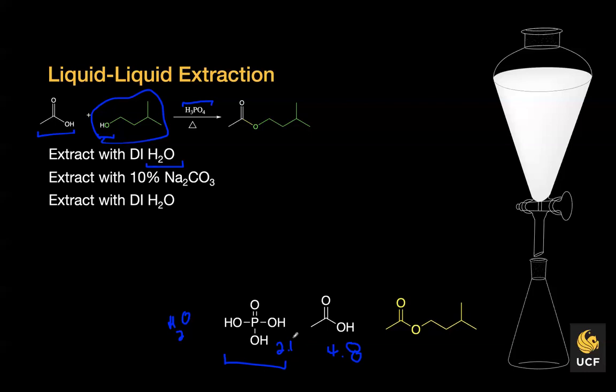Okay, and then we go once again and we separate the aqueous layer from the organic layer, and then we add 10% sodium carbonate. Now, what is sodium carbonate really doing in solution? If you take a look at sodium carbonate, what might be the role of sodium carbonate? Would it act as an acid? Would it act as a base? It would act as a base. You have the two alkoxide ions, it's resonance stabilized, right?